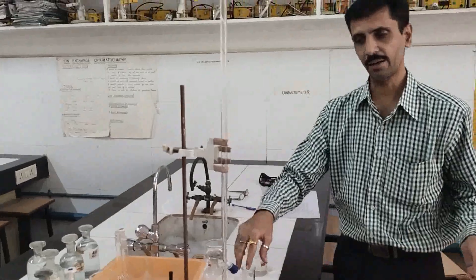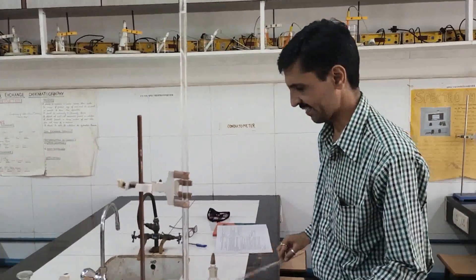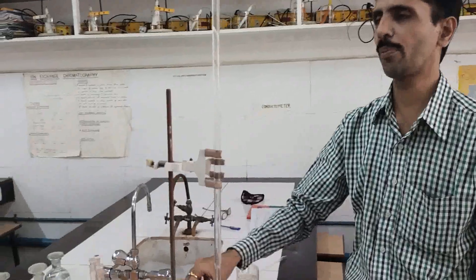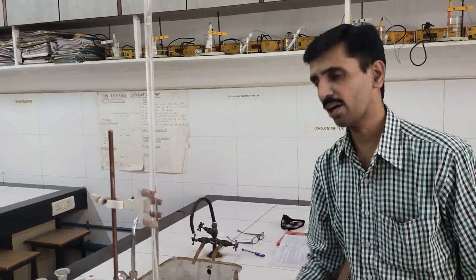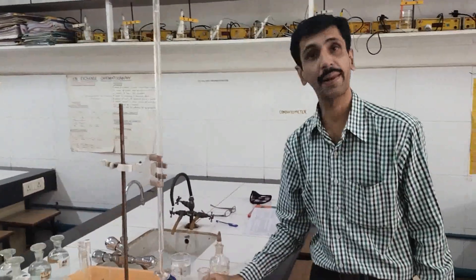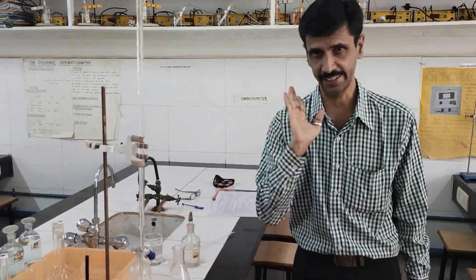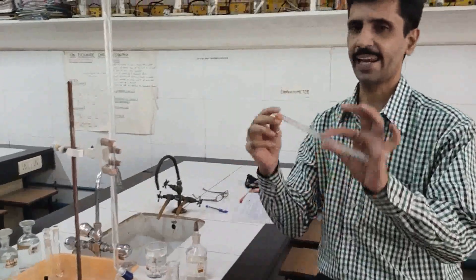As the procedure — I have already explained to you in my theoretical session. The burette is being filled with 0.05 normal NaOH. I have got 0.05 normal acetic acid, which I am going to pipette out as 20 cm³. I am going to titrate it using phenolphthalein as an indicator. Here we go. This is a 10 ml pipette.